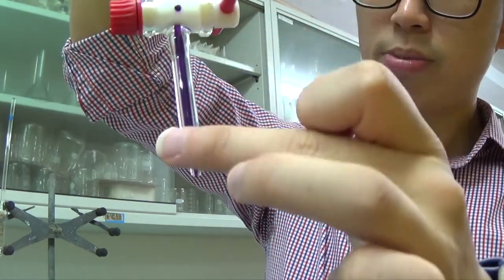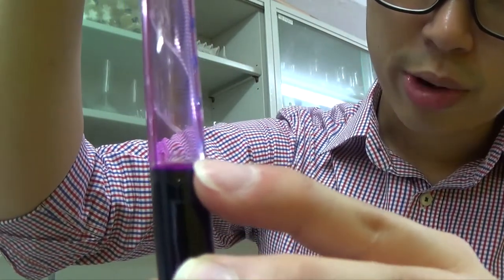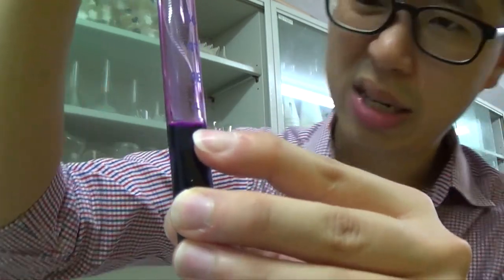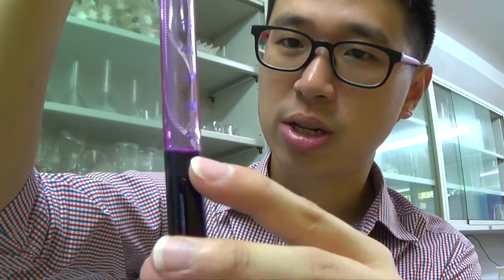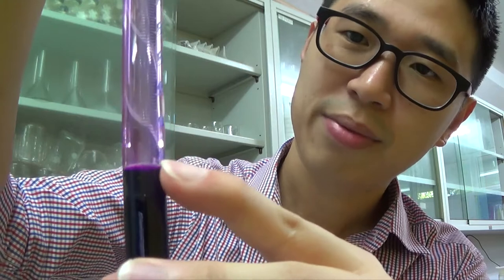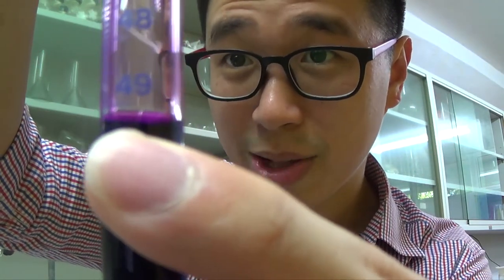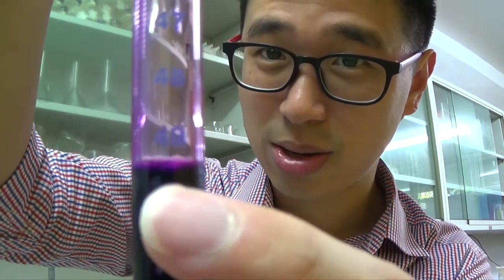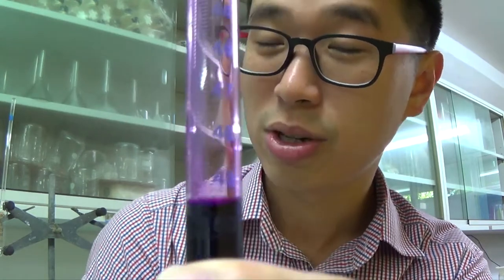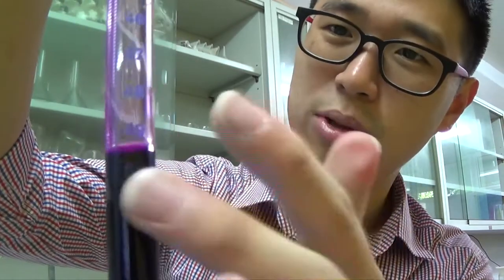This will be drop by drop, as it's from a burette and it's pretty accurate. It is very, very difficult to read the reading below the meniscus for anything that involves a dark solution like this. So whenever we're doing a titration experiment involving KMnO4, we always read from above the meniscus. Okay, and this is how I always read it. There's almost no way for you to read below the meniscus because of how dark the solution is, unless you got superpower eyesight. We always read above the meniscus only for dark solutions like this.